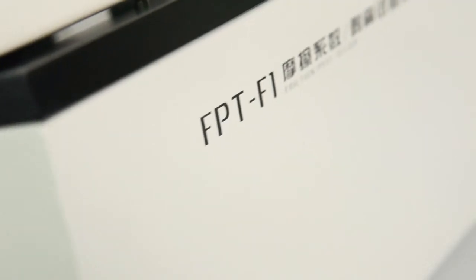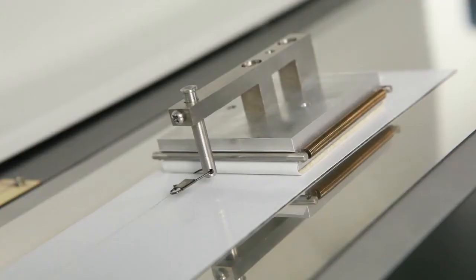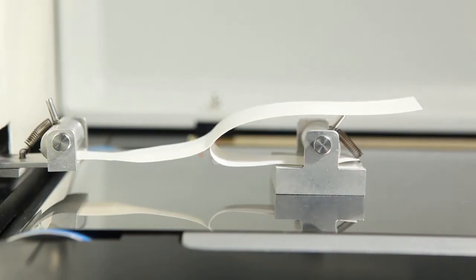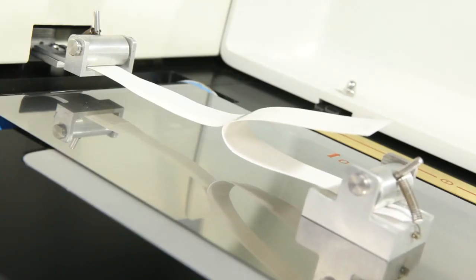FPT-F1 is LabThink's latest generation of friction and peel tester. It can be used to measure the static and dynamic coefficient of friction of plastic films, plastic sheets, paper, and other materials, as well as the peel strength of tapes, release paper, protection films, and others.